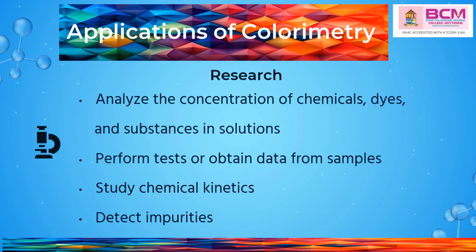In research, it is used to analyze the concentration of chemicals, dyes, and substances in solutions, to perform tests or obtain data from samples, to study chemical kinetics, to detect impurities.